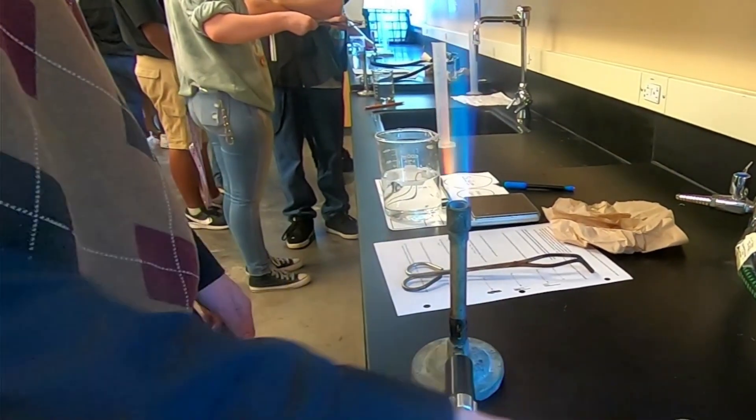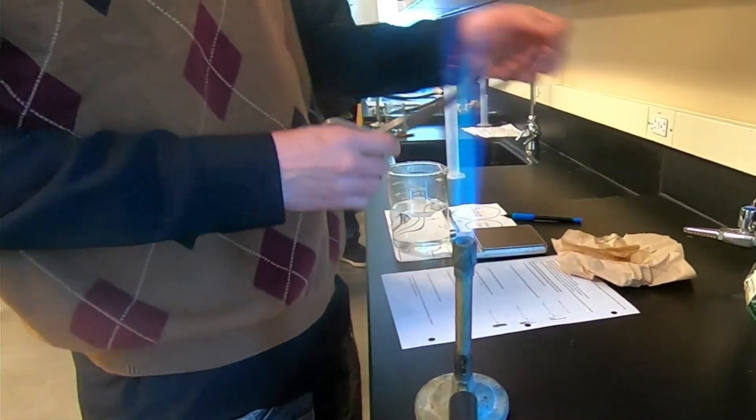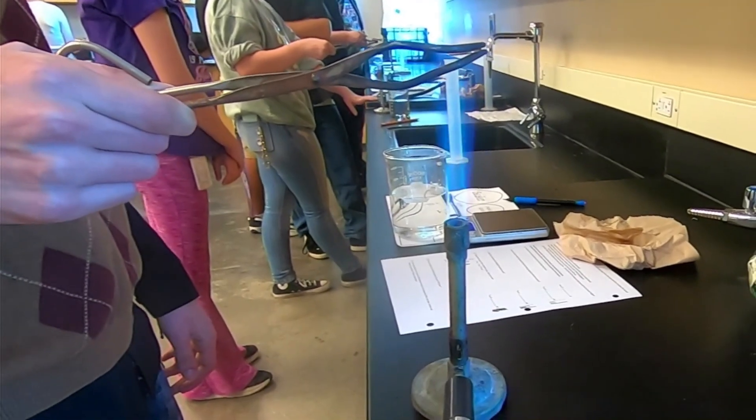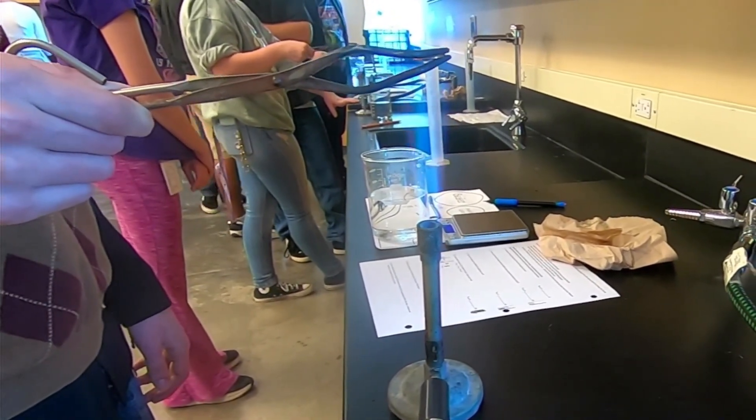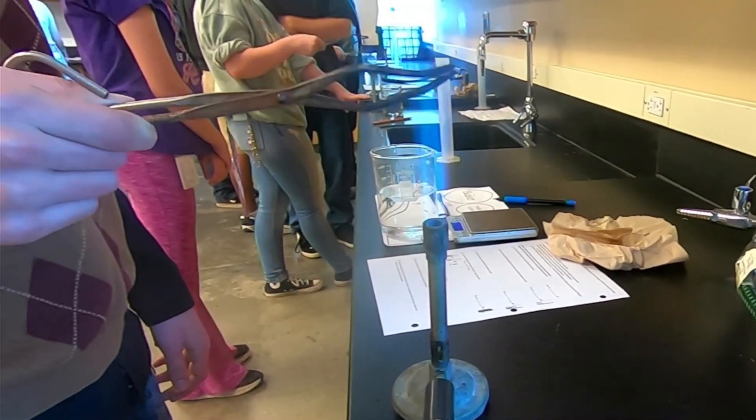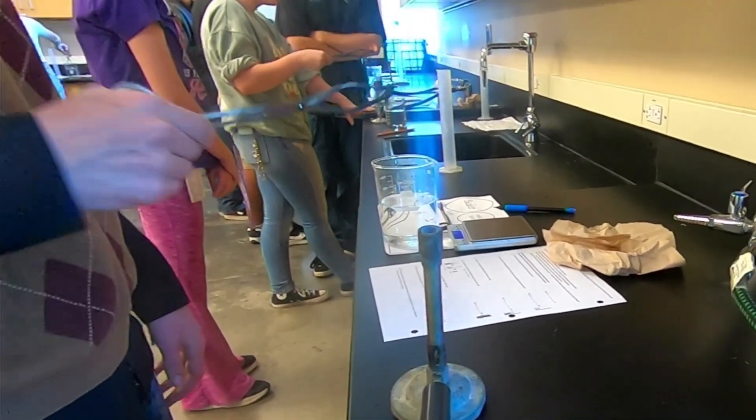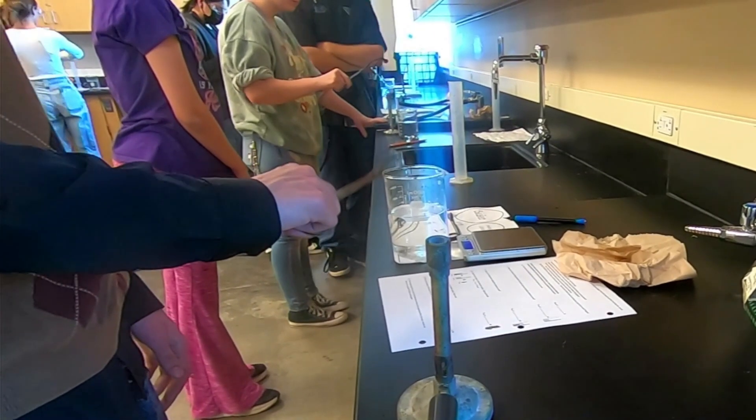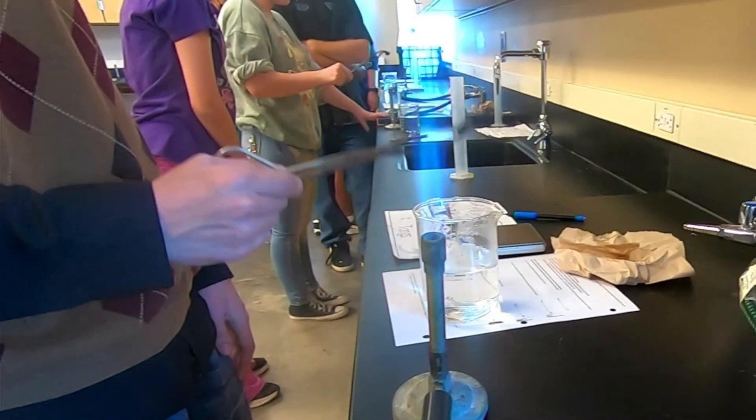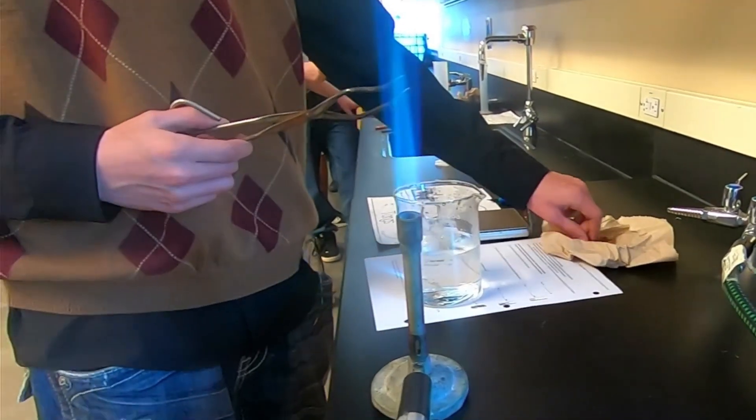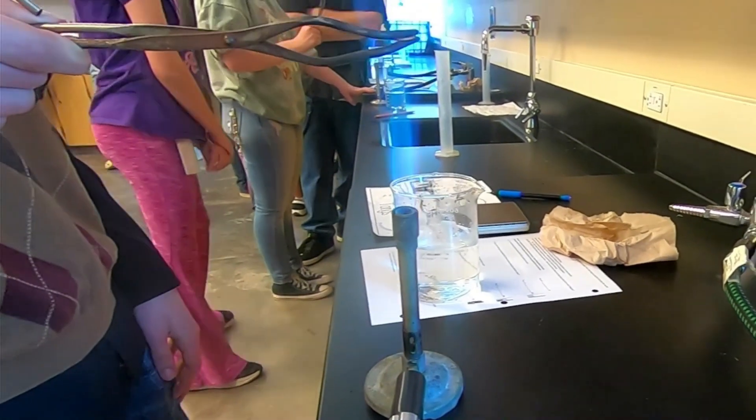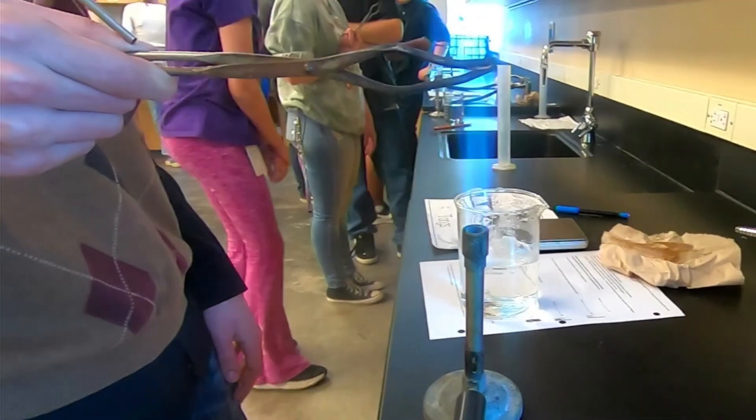This is basically when we were going through and melting the inside of the pennies. The copper coating on the outside of the pennies will not melt. If you're looking in your lab, you can refer to the table on the bottom right of the front page. That table has the melting point of copper listed—1083 degrees Celsius—super super super hot, and the copper is not melting.